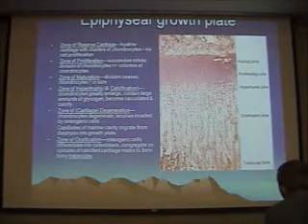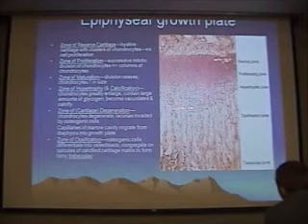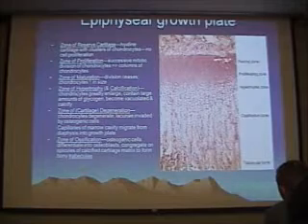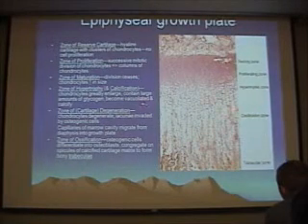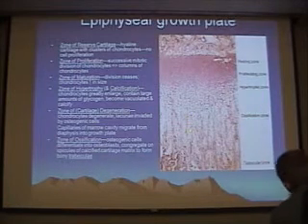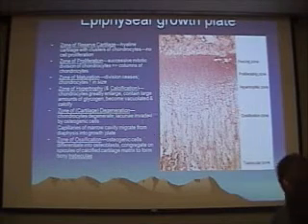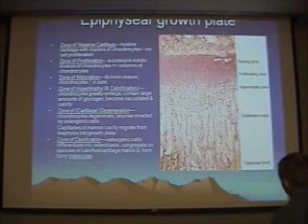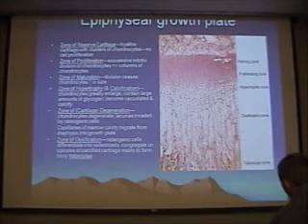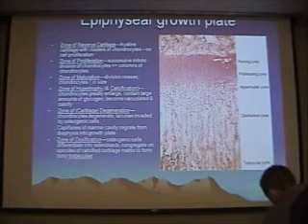Eventually, they die. And as the cells die and degenerate, these empty spaces become infiltrated by osteogenic cells that migrate up from the marrow. So we have the zone of degeneration, and then as these osteoblasts start producing extracellular product, matrix, we develop this ossification zone, and then finally the production of these bony trabeculae, which result in mature bone and eventual closure of the epiphysis.